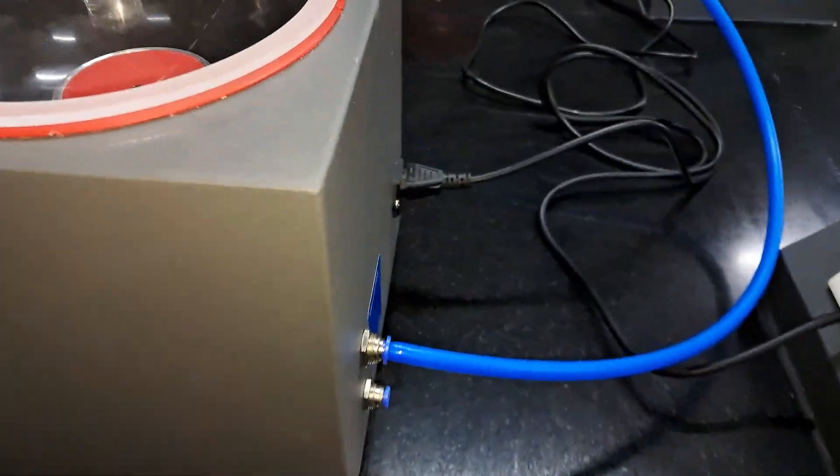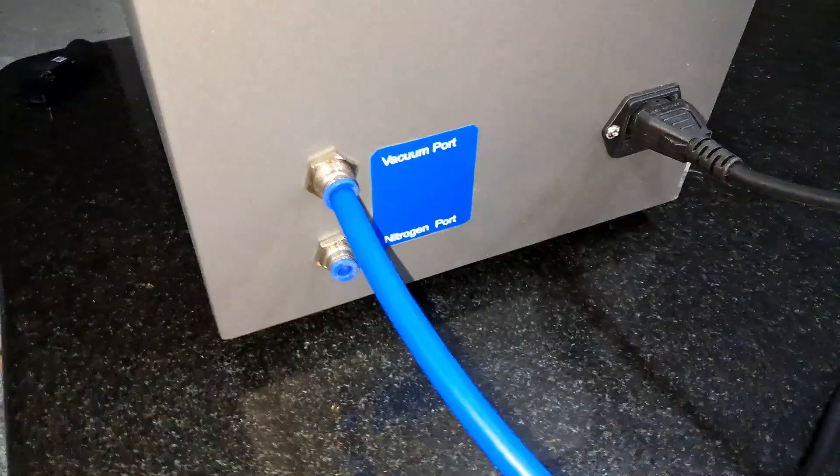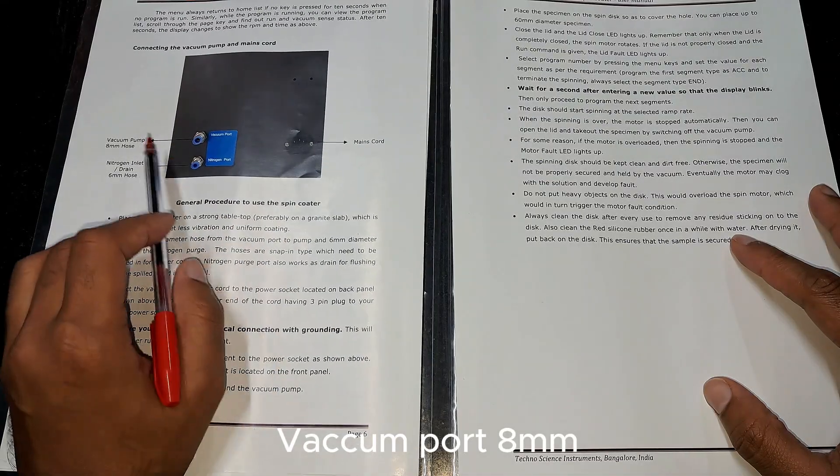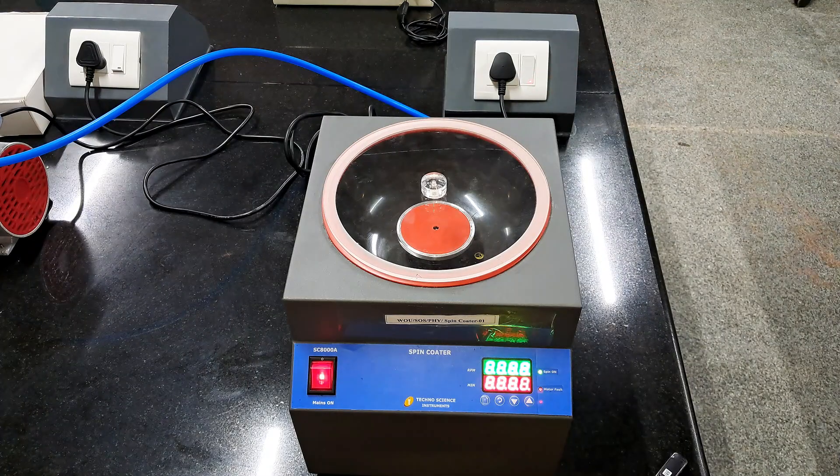The vacuum pump has been connected to the spin coater with this 8mm hose pipe. So at first I will switch on the machine.